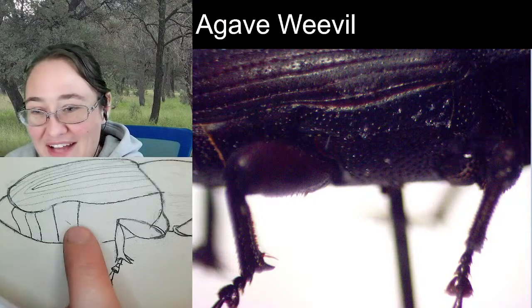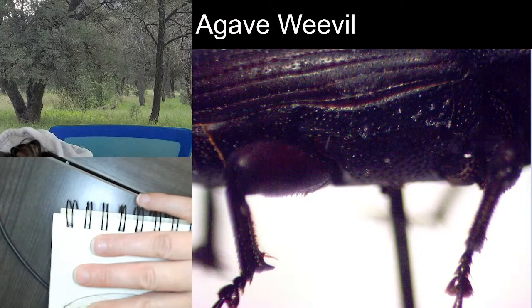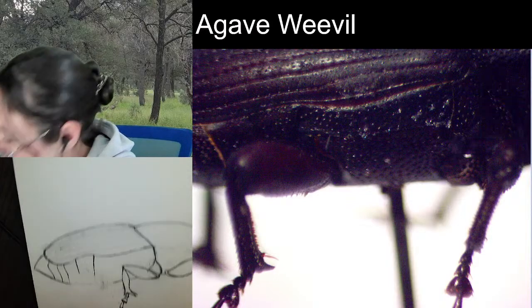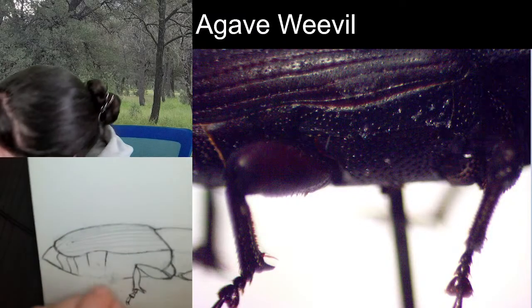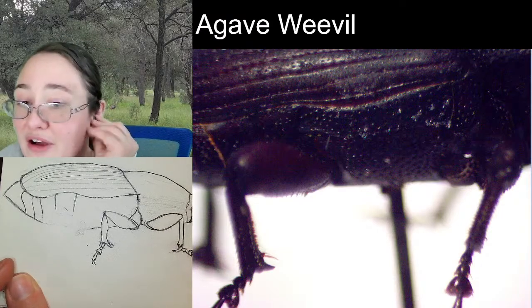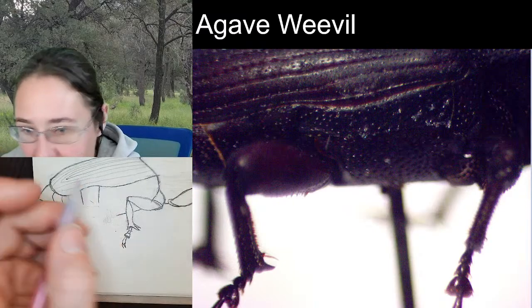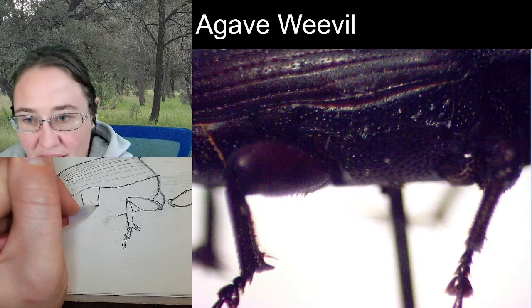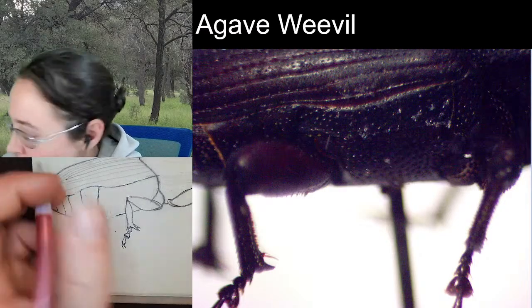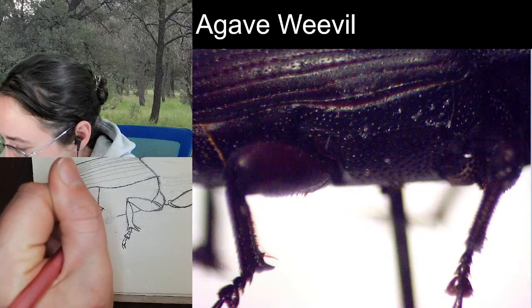Now our hind leg... Oh, I forgot to tell you. You can only see the top parts of these abdominal segments. Our hind leg is going to be going right through this. Might as well erase it now. Alright, because our femur is connected right here at the end. So if I take this back line here, this would technically be the end of the thorax, and this is our first segment of the abdomen. I'm going to take this line and arch it this way.